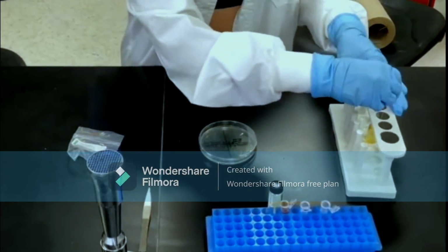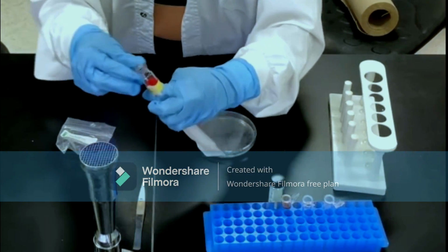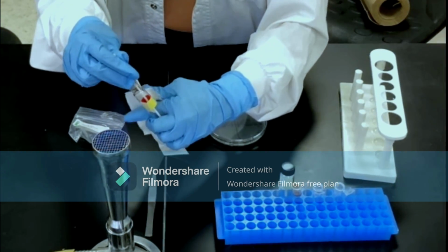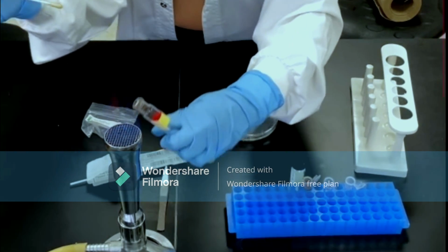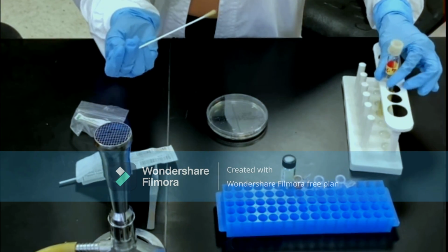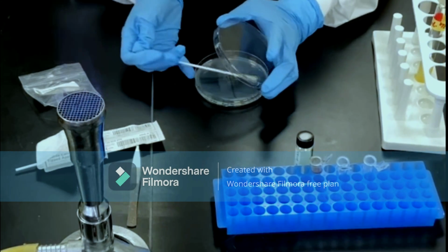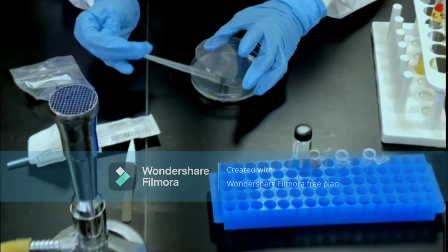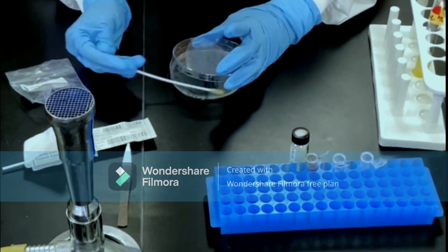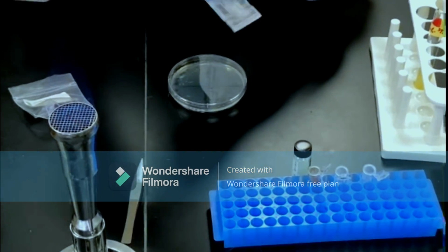Next, we are going to use a sterile swab to inoculate the plate using the same method. Grab the test tube and remove the cap and gently flame to sterilize. Dip the swab into the bacterial broth. Remove the tube and gently flame sterilize. Then recap the tube. Next, pick up the plate and using the swab in a side-to-side motion, swab the plate gently. The idea is to create a uniform layer of bacteria. To do this, slightly rotate the plate. When the entire surface of the plate has been covered, dispose of the swab in a biohazard container.